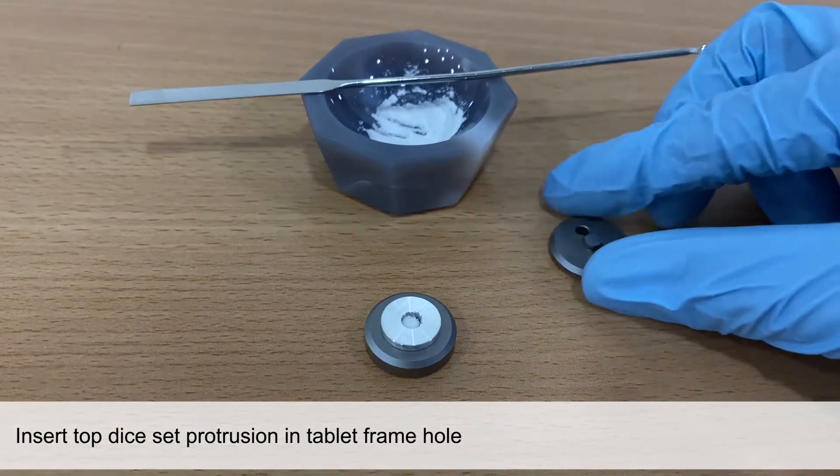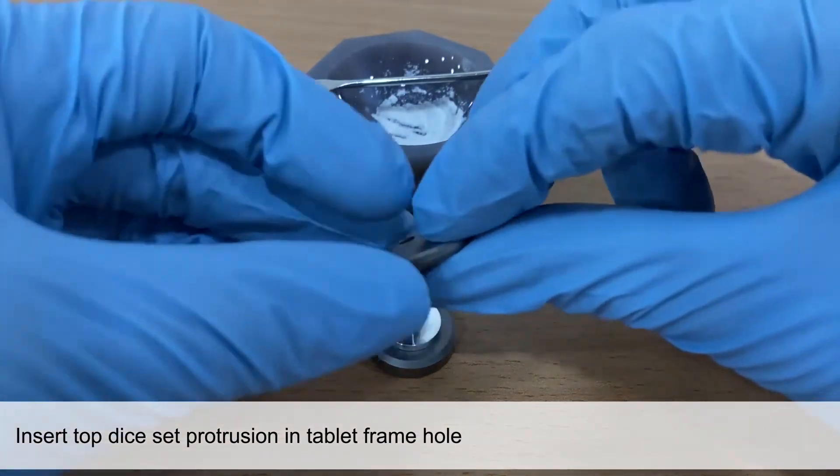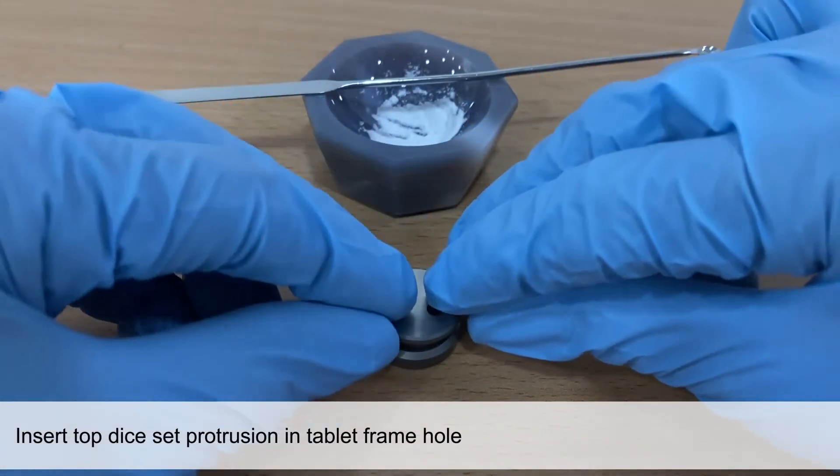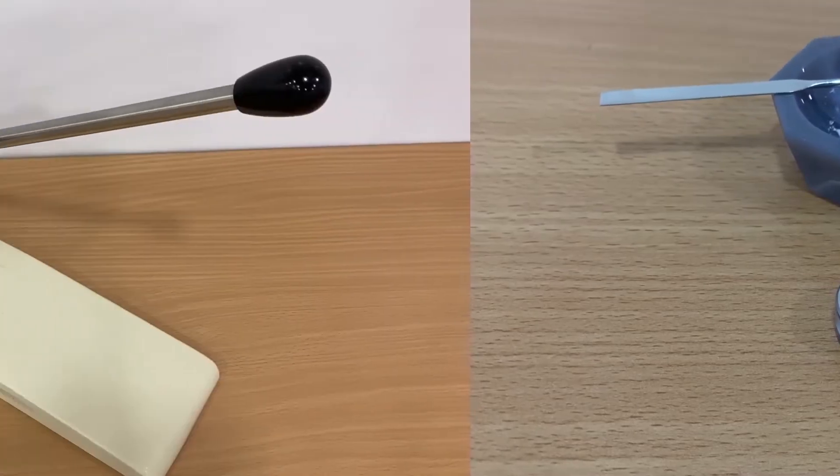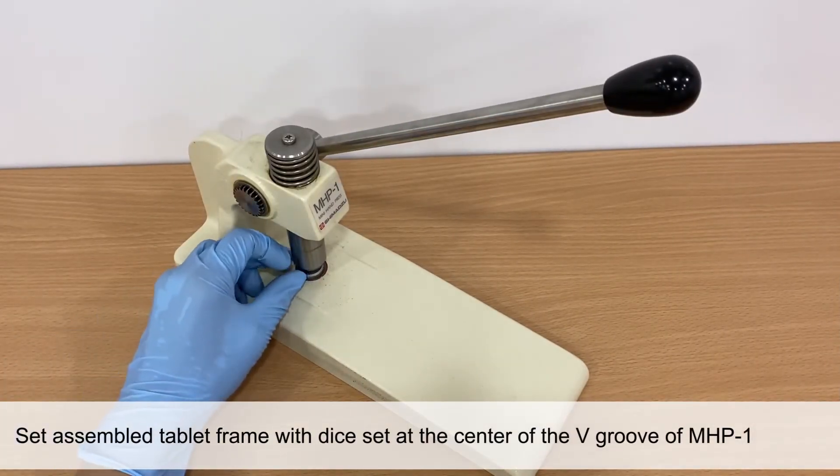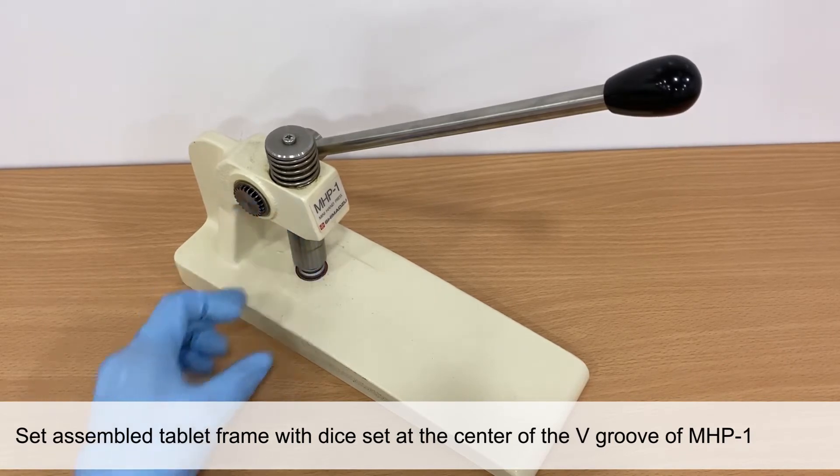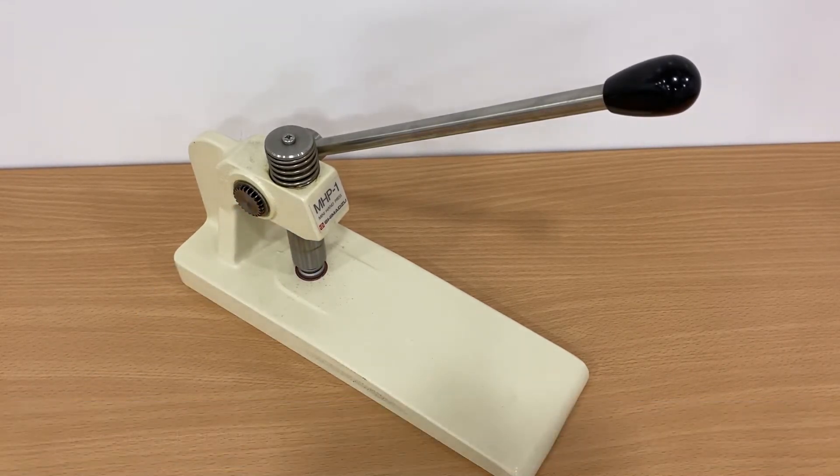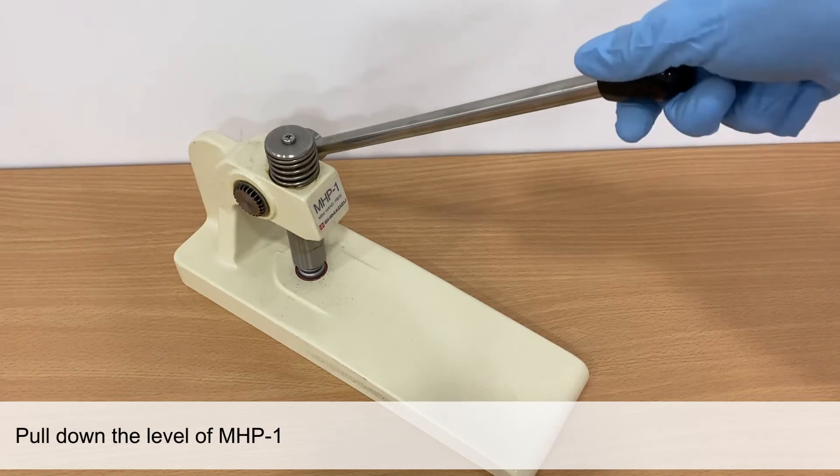Then, insert the top dice set protrusion in the tablet frame hole. Set the assembled tablet frame with dice set at the center of the V-groove of the mini hand press. Pull down the lever to press onto the dice set.